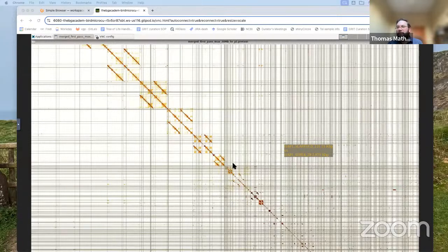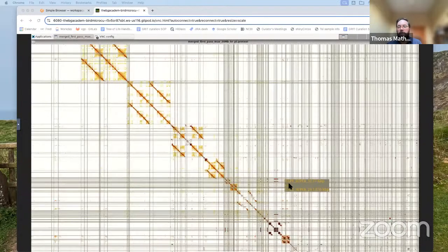For example, I think this map, I've remade it now, and there's about 400 edits in the whole map, just of the scaffolds shorter than 20 megs. So in this assembly there was a lot of extra work to do by zooming in, but I feel a lot more confident about the individual chromosomes and the quality of the assembly of those chromosomes than if I just used the zoomed out map. So I think it helps.